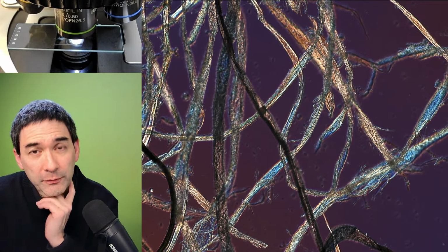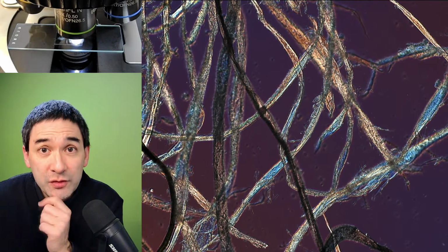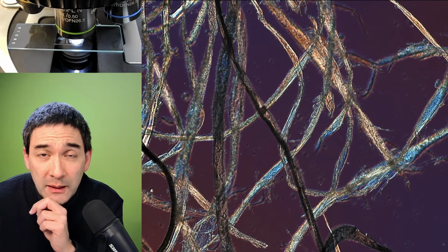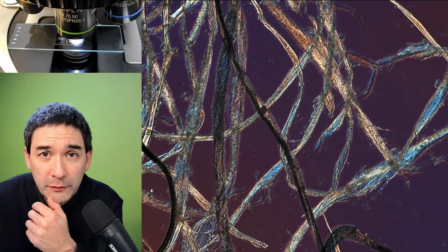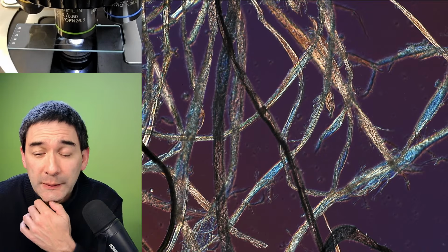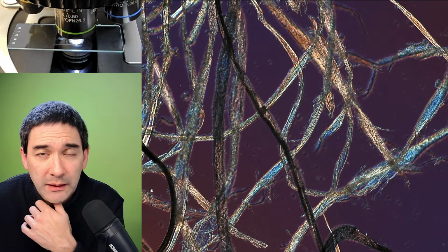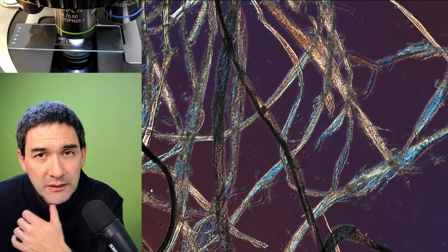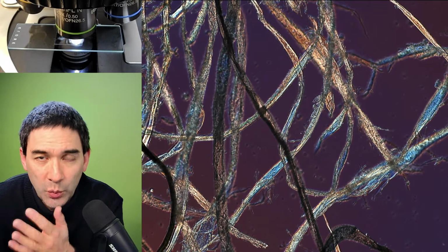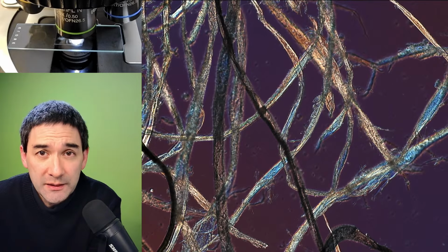A couple of months ago, I did make some videos, some live streams even, so you might want to go back a little bit and check this channel, where I presented a couple of adapters, also camera adapters and so on, to give you an overview. It is indeed like this, that you do not absolutely need a dedicated microscope camera. You can also work with mobile phones.